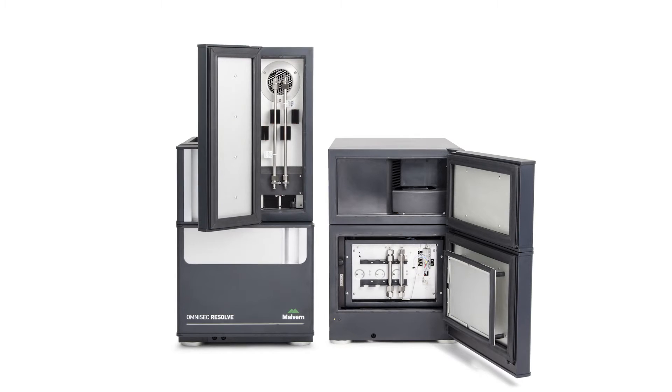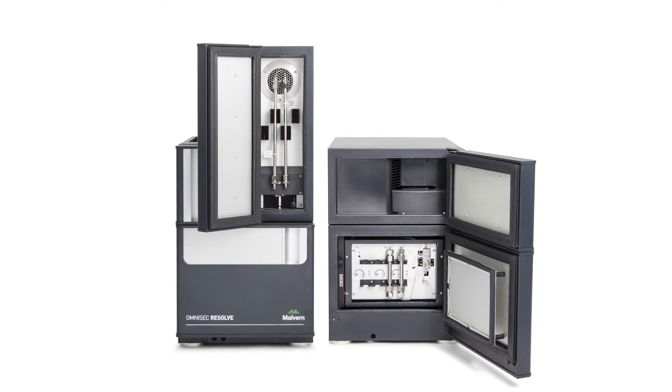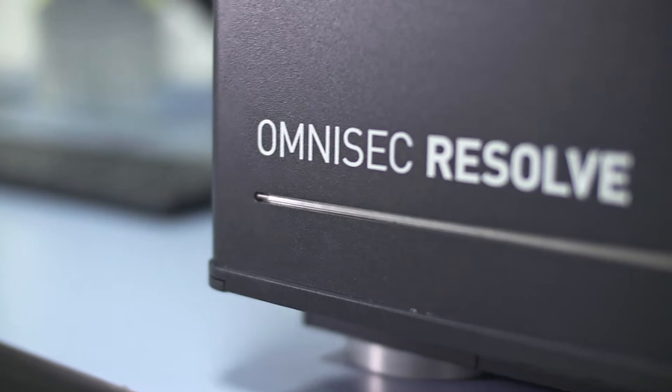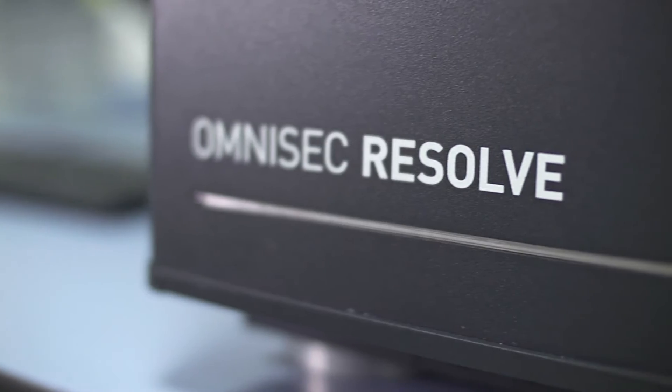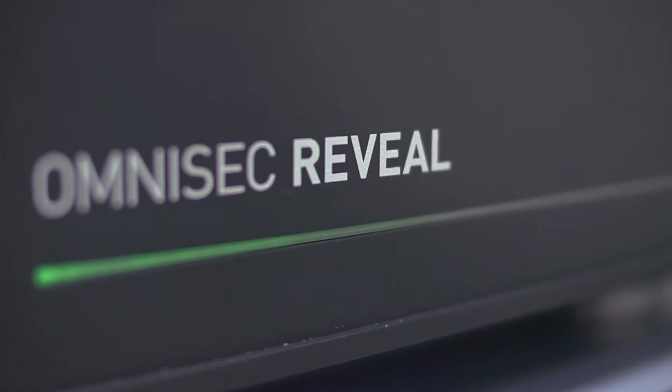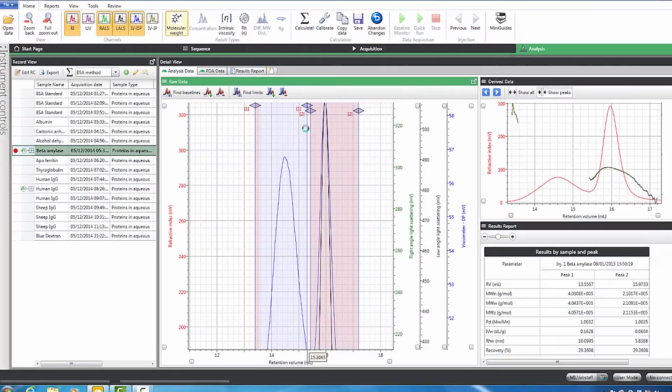The complete integrated Omnisec solution is made up of three components: Omnisec Resolve, Omnisec Reveal, and Omnisec Software.